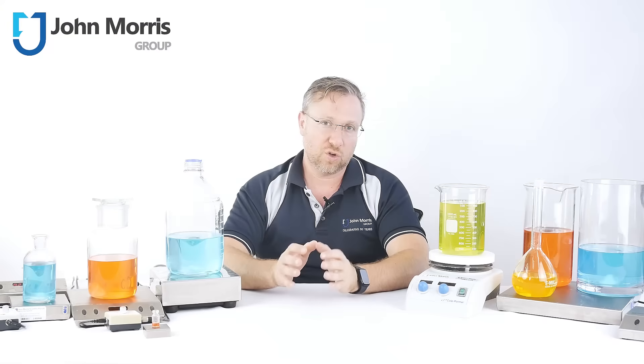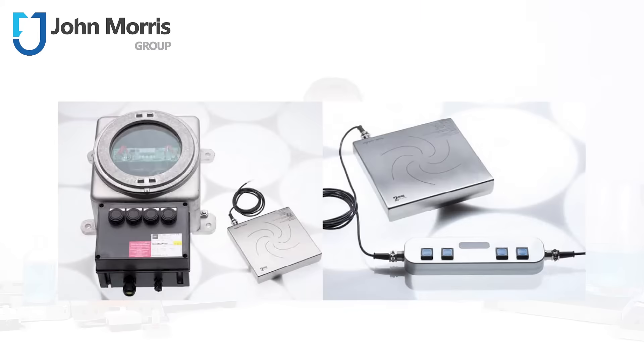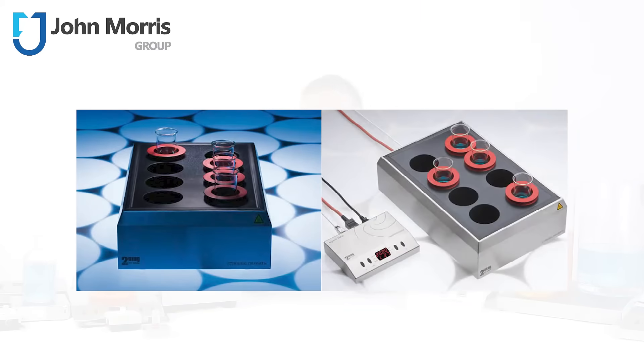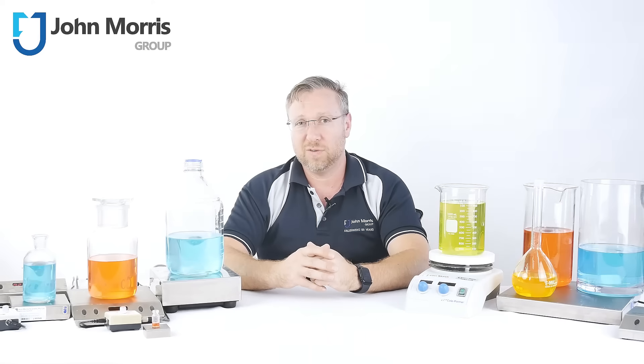The sealed construction also allows for explosion rated stirrers and they're available as stirrer hot blocks, and these are perfect for environmental testing facilities.